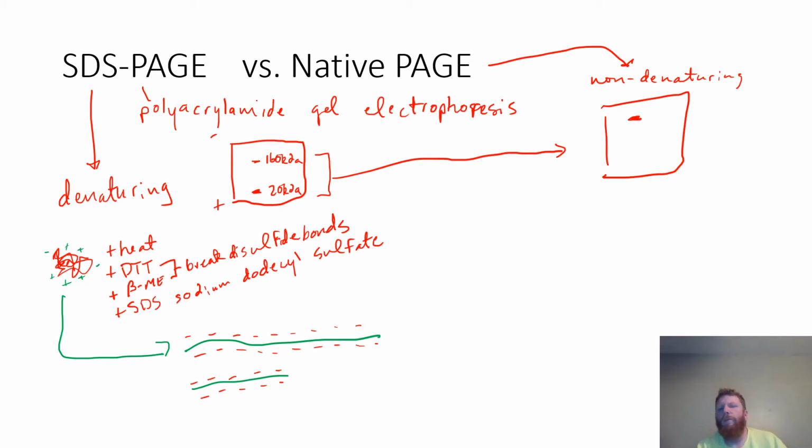Why would you see 1 band? Well, one reason for that is you could be looking at a dimer. So the great thing about SDS-PAGE versus native PAGE is for comparison. So if you do a native PAGE and you see 1 band in there, and then you subject the same sample to SDS-PAGE analysis, and you see 2 bands in that SDS-PAGE, well, then you'd be able to say, I'm working with a dimer, or at least a dimer that is probably 180 kilodaltons.